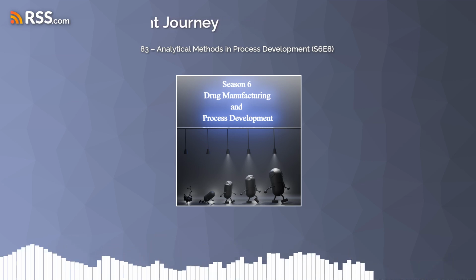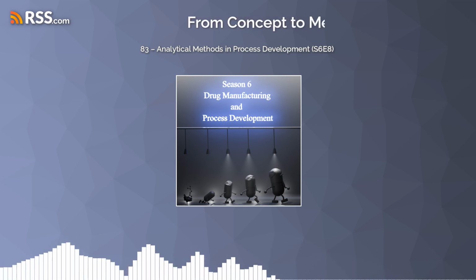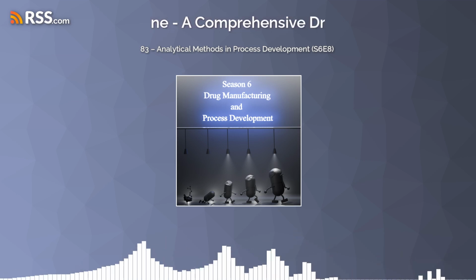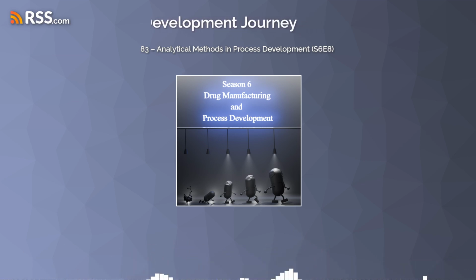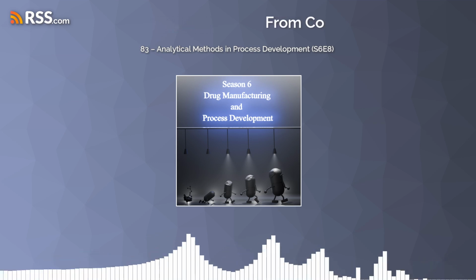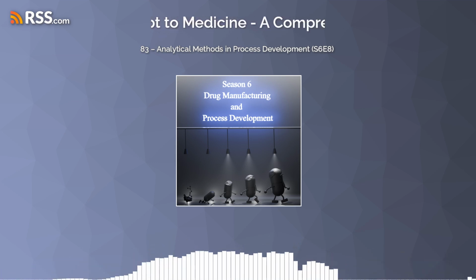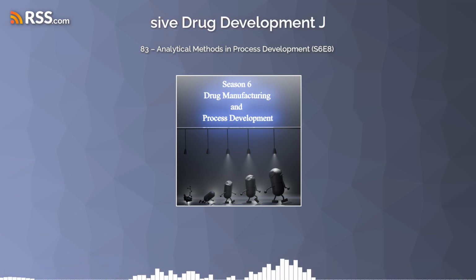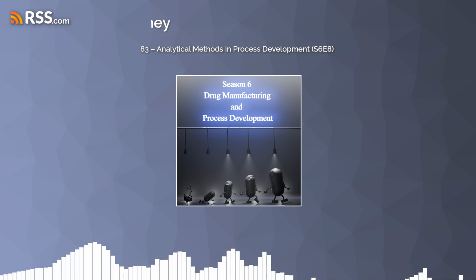Let's say we're making molecule Y, but we're getting a low yield, and our analysis shows this mysterious peak that we just weren't expecting. That's always a head scratcher. So first we need to figure out what that mystery peak is, right? Right. So we can use HPLC to separate all the components of that reaction mixture, including that unknown peak. And then we can compare its retention time to known compounds, or use LCMS to figure out its mass. And that might help us identify it. So maybe it's an unexpected intermediate that just isn't converting properly. Or maybe it's a side product that's eating up all of your starting material. So it's going down a different path.